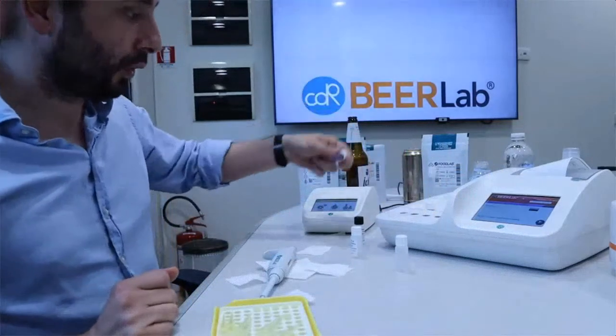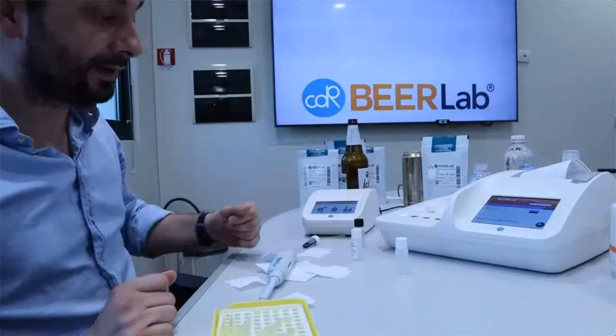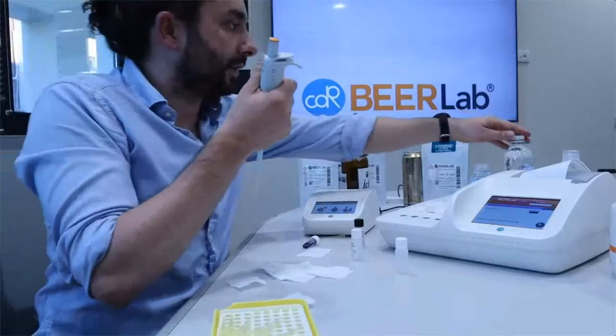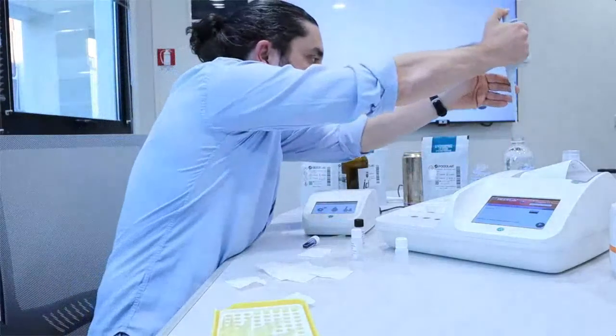Sample 2, because of course we have read 2 blanks, 2 cuvettes, so the analyzer is waiting for the second sample, and we are going to collect the second sample, this one.